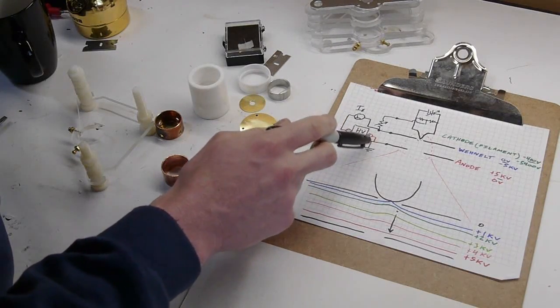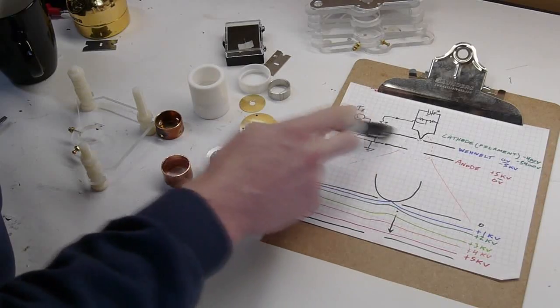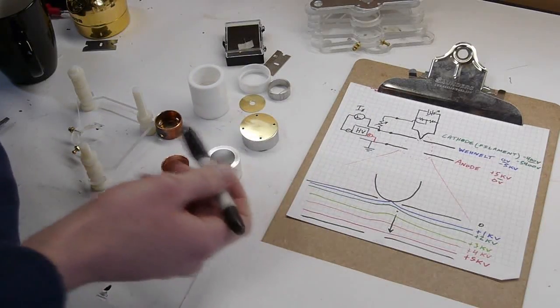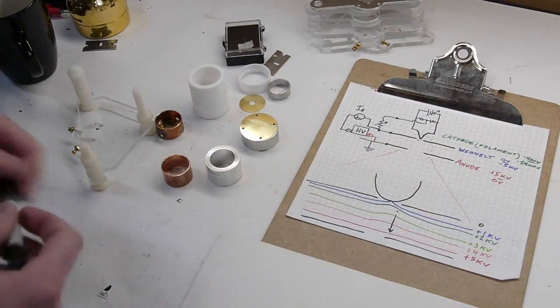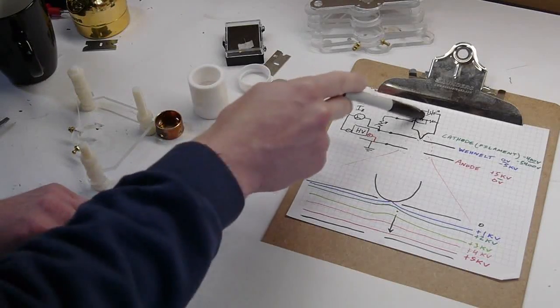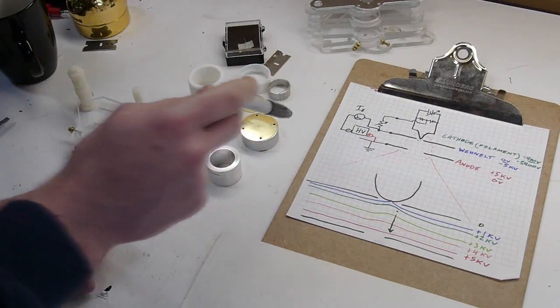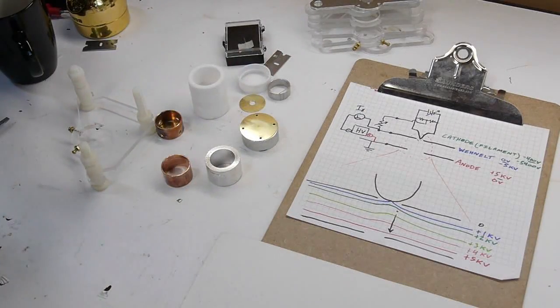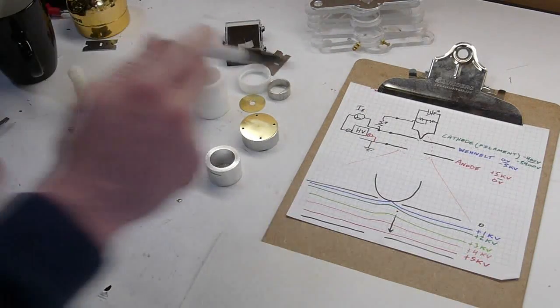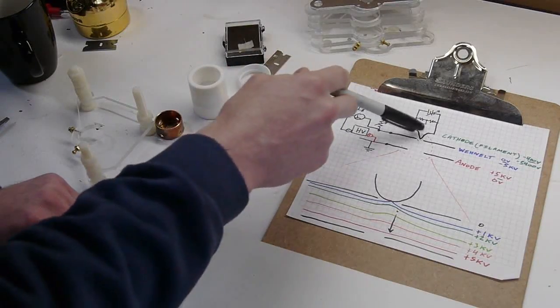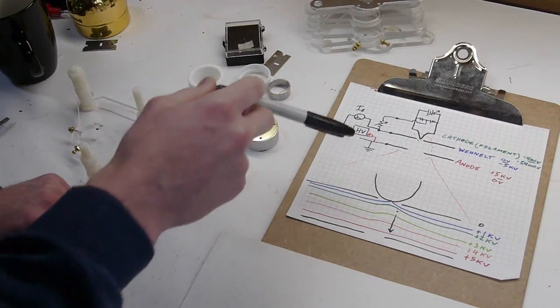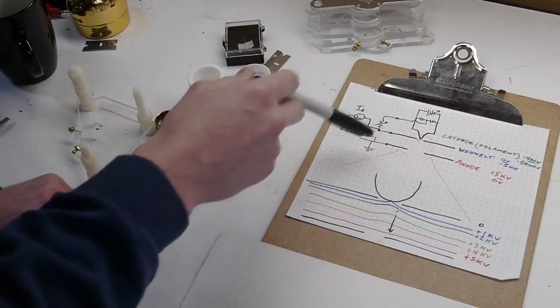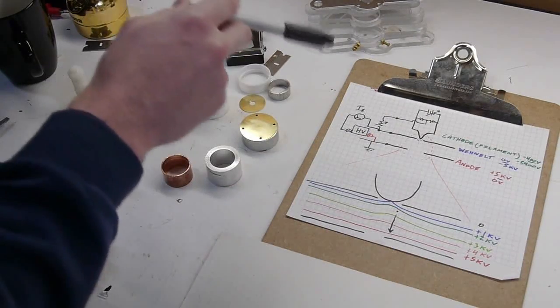So our high voltage supply is connected between the anode and the Wenelt and that's always some fixed value, like let's say five kilovolts. But what's the voltage on the cathode? In this case, this bias resistor sets up something known as automatic biasing. So as this gun is running and electrons are coming out of the filament, its potential is actually going negative... excuse me, positive.